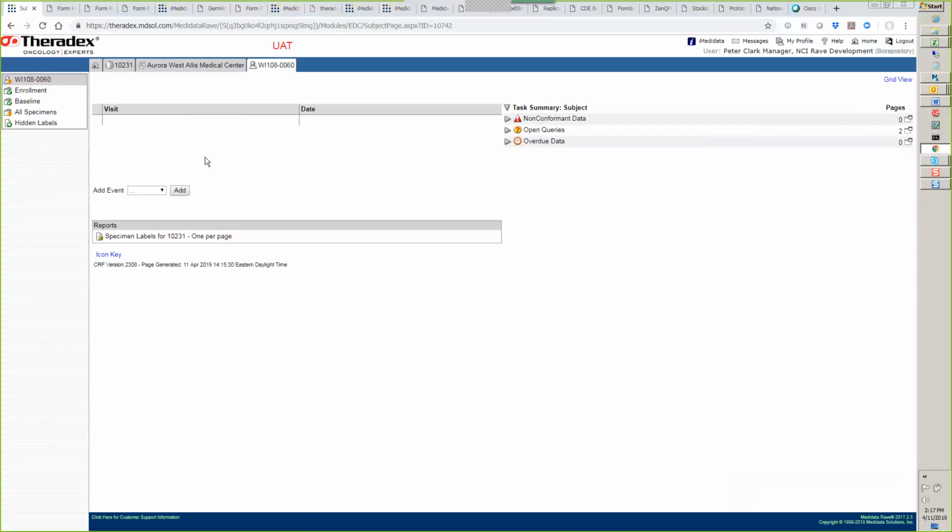Because together those 2 modules make up what we have to do with the data. Yes. So, Michelle, if we could do it either way, we should probably discuss what you think would be most valuable. We could customize the biorepository role for that particular study so that you can see those PK data points. Or we could just continue allowing you to have the read-only all sites access. Is that what you've got right now? Yeah, I have the read-only all sites, for everybody on trial for all the trials that we're involved with.